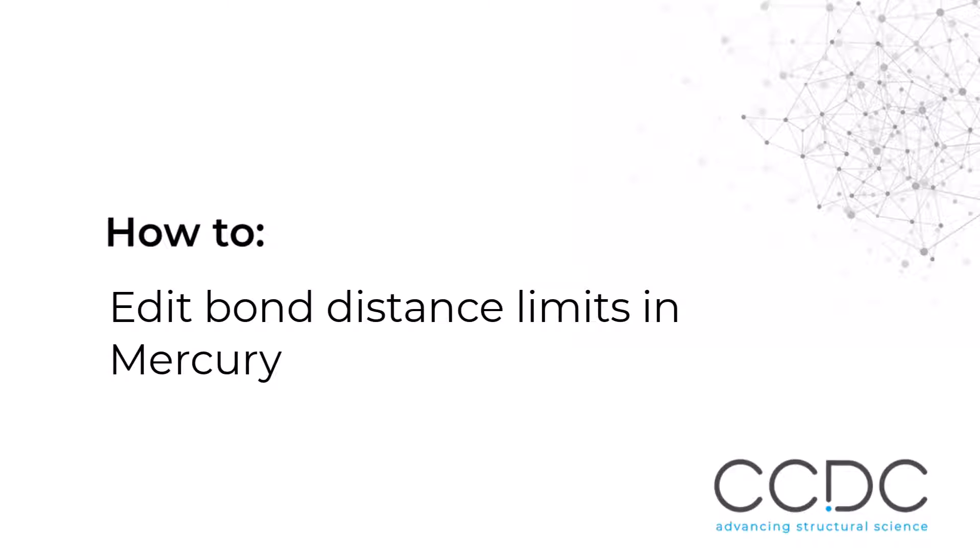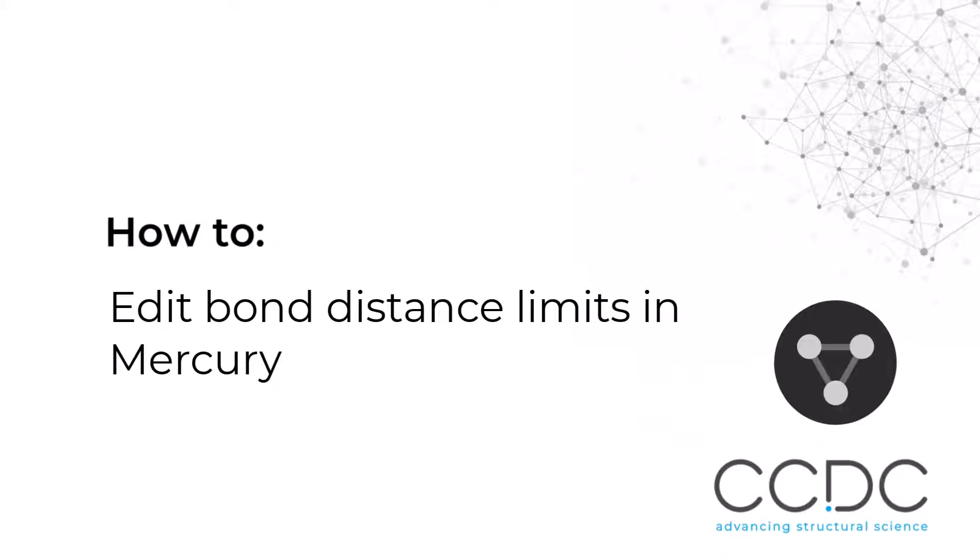You can use Mercury to visualize and analyze your own structures. Let's open Mercury.